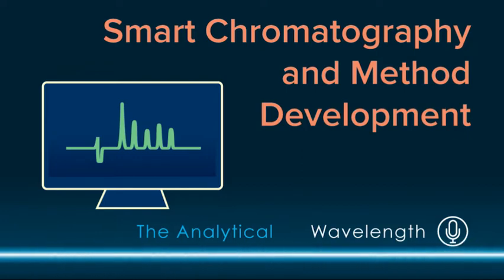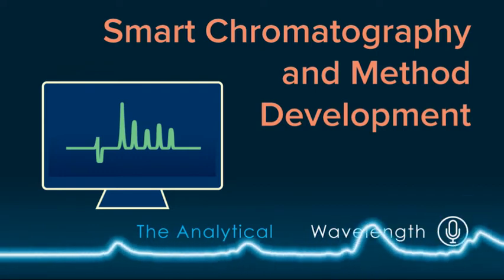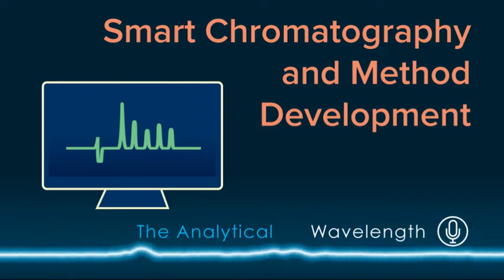Hi, I'm Jesse. I'm Karis. We're the hosts of the Analytical Wavelength, brought to you by ACDLabs. In this episode, we're going to talk to a scientist from GSK about the advantages of computer-assisted chromatographic method development in a large pharmaceutical organization. But first, we're going to talk with Dr. Scott Van Bramer. He's a professor at Widener University, and he'll provide an introduction to using predictive tools in chromatographic method development by describing his experience teaching the software to his students.